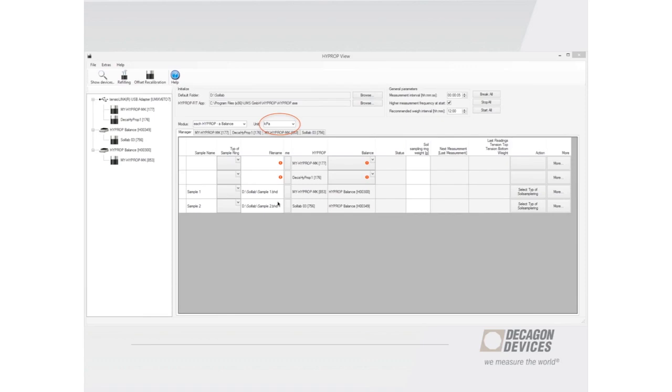Another nice addition is that the software now supports additional units — centimeters, kilopascals, and hectopascals. This will also eventually be integrated into HyProp Fit. This is especially helpful because different users prefer different units — some prefer centimeters, some prefer hectopascals, some prefer kilopascals.